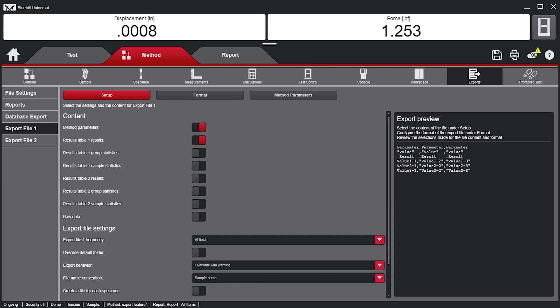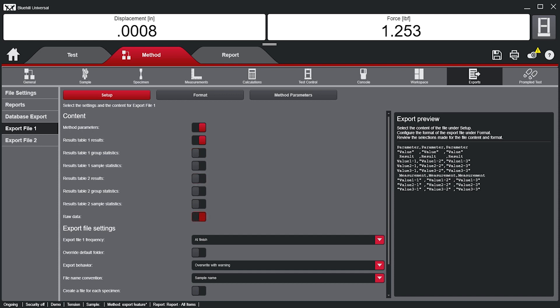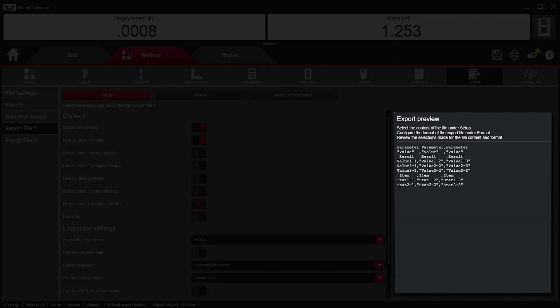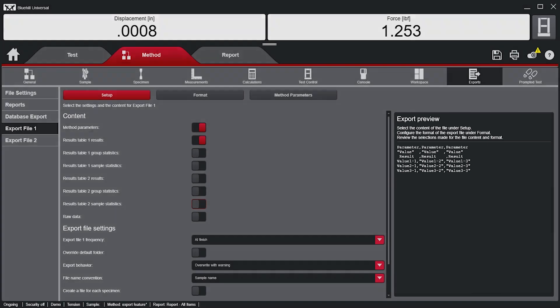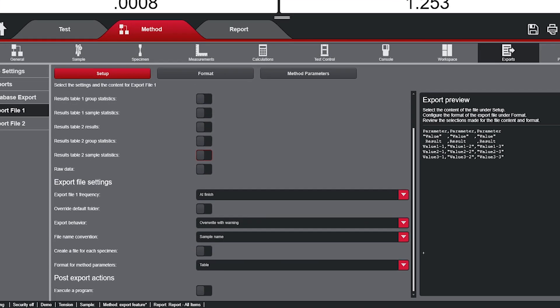Under the Setup tab, within the Export File tab, this is where users have the flexibility to determine the content of the export by using the toggles here. The Export Preview is an easy way to visualize what your final export file will look like.